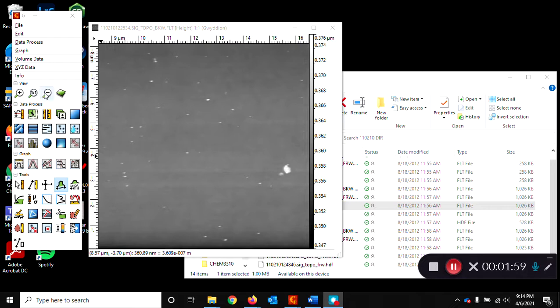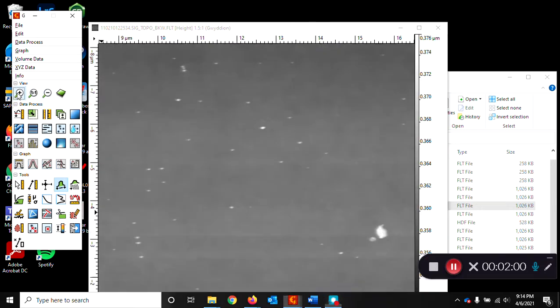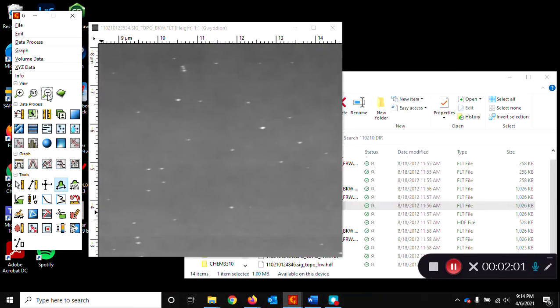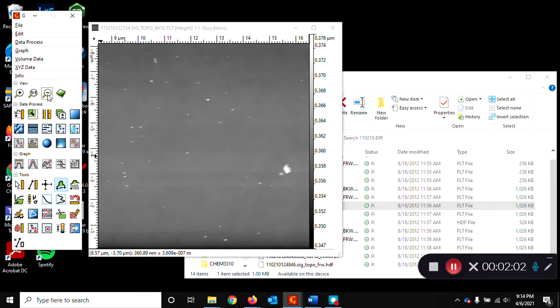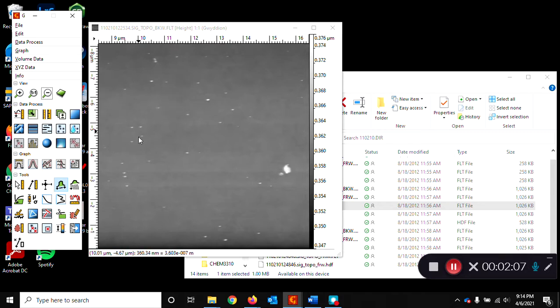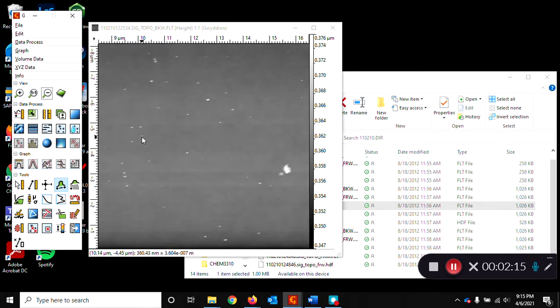You can zoom in or zoom out on this image and you can see that there's bright points and a relatively flat surface. These bright points are probably our nanoparticles. So we want to measure the size of those.